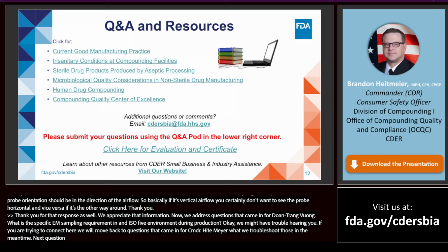Is there a mandatory requirement for humidity specification in the aseptic area?